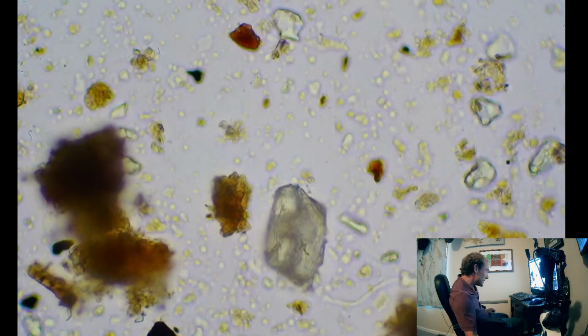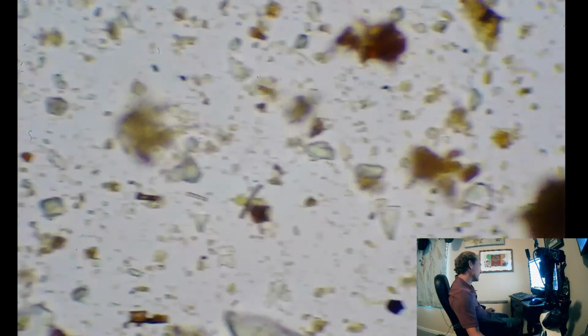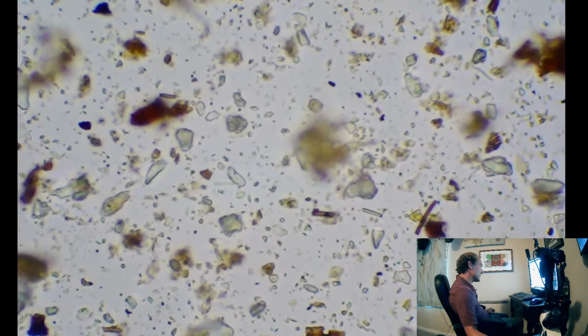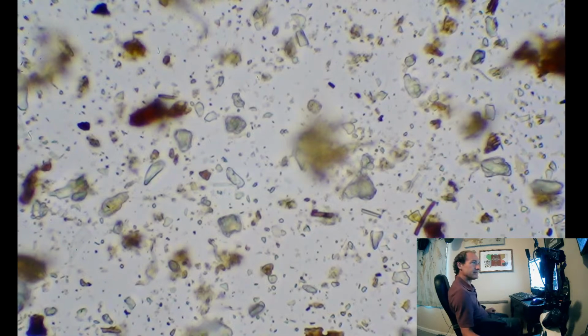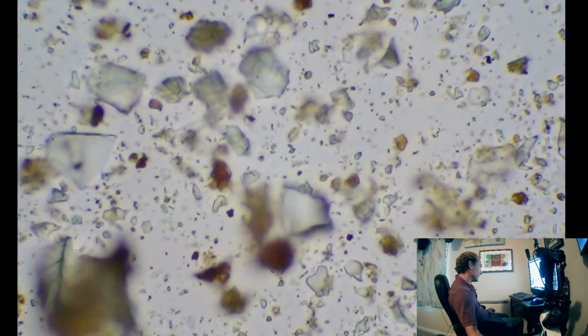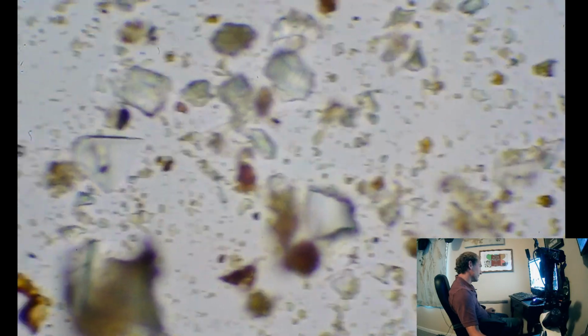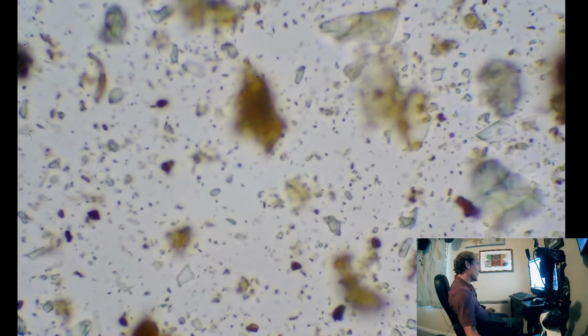Ultimately super ununiform, but clear, and no septi. There's a good one.